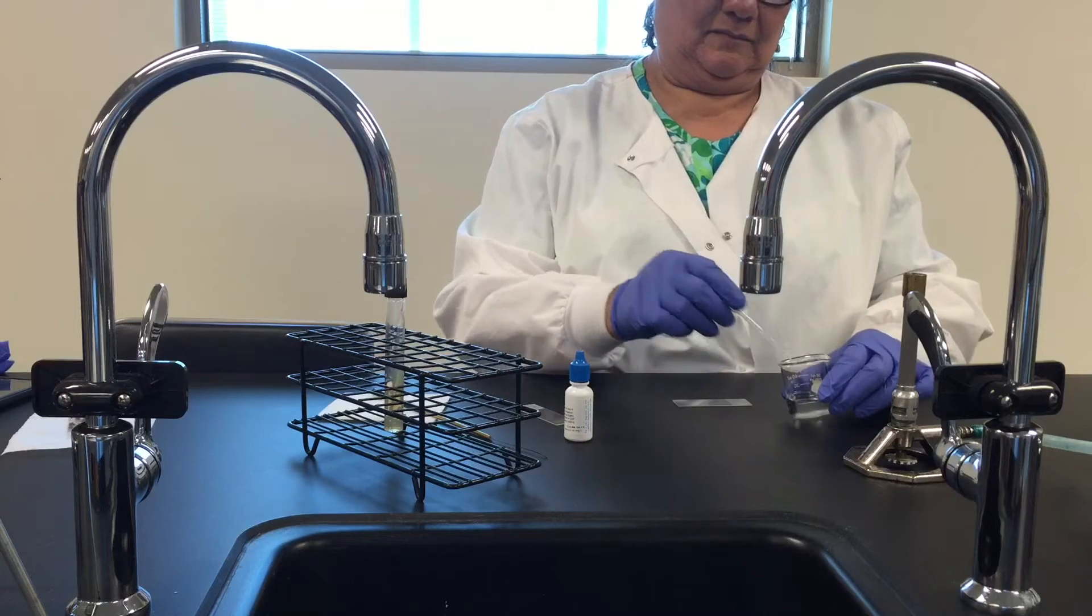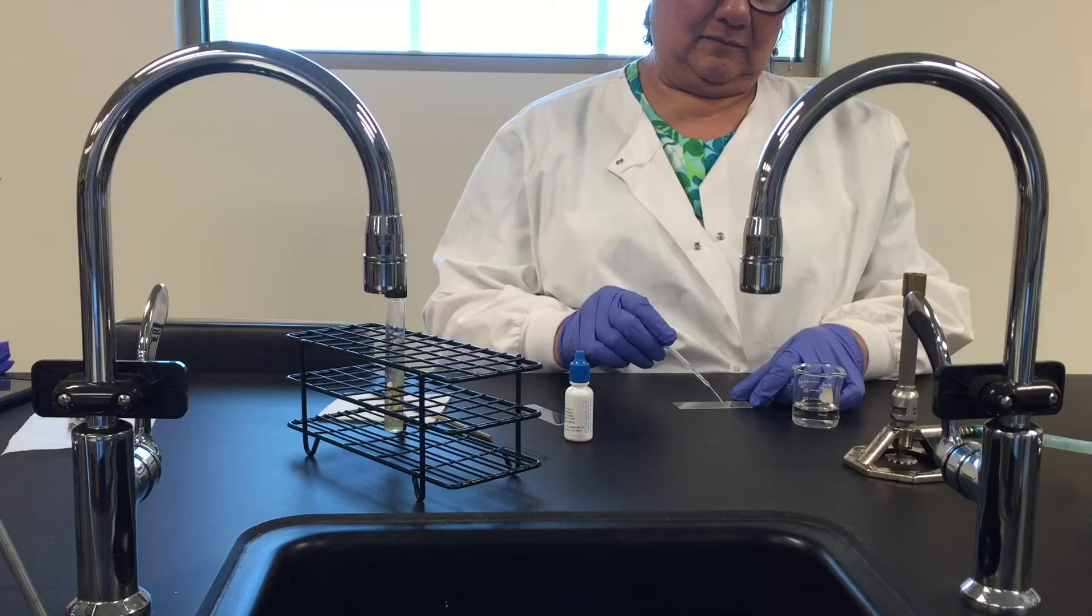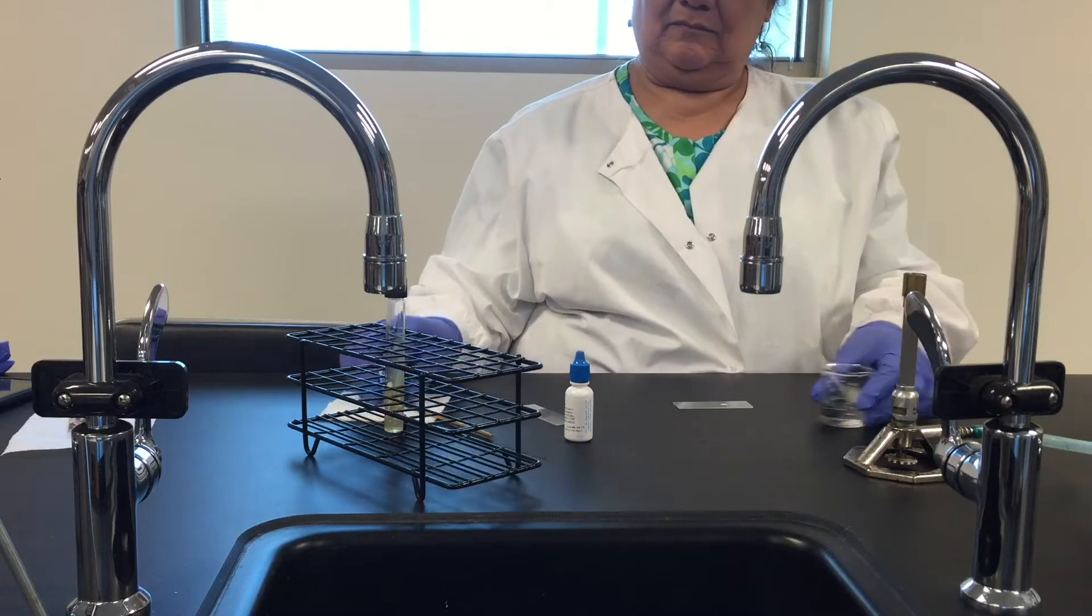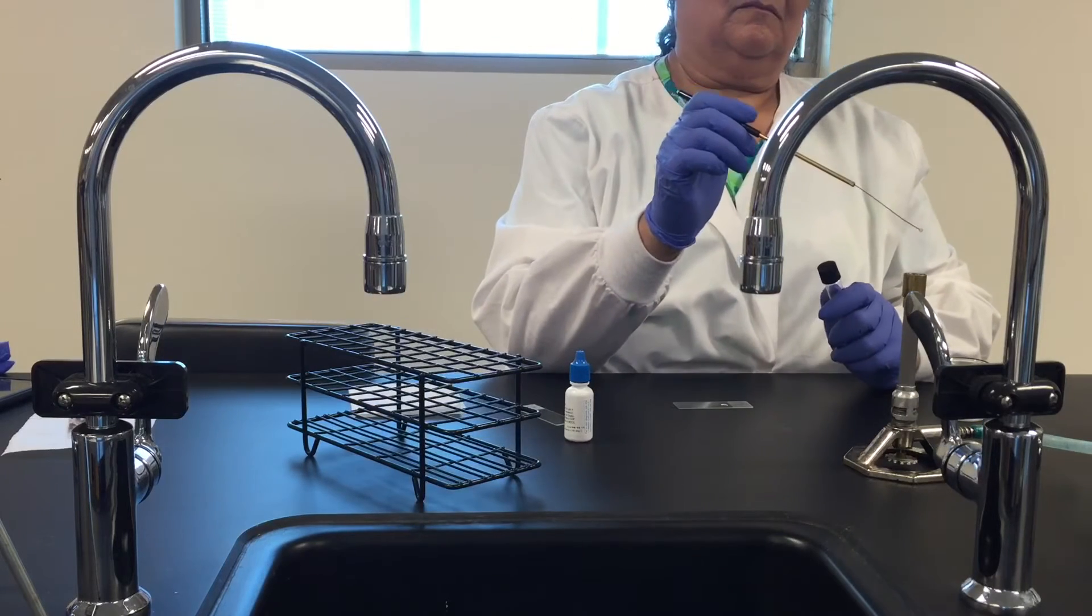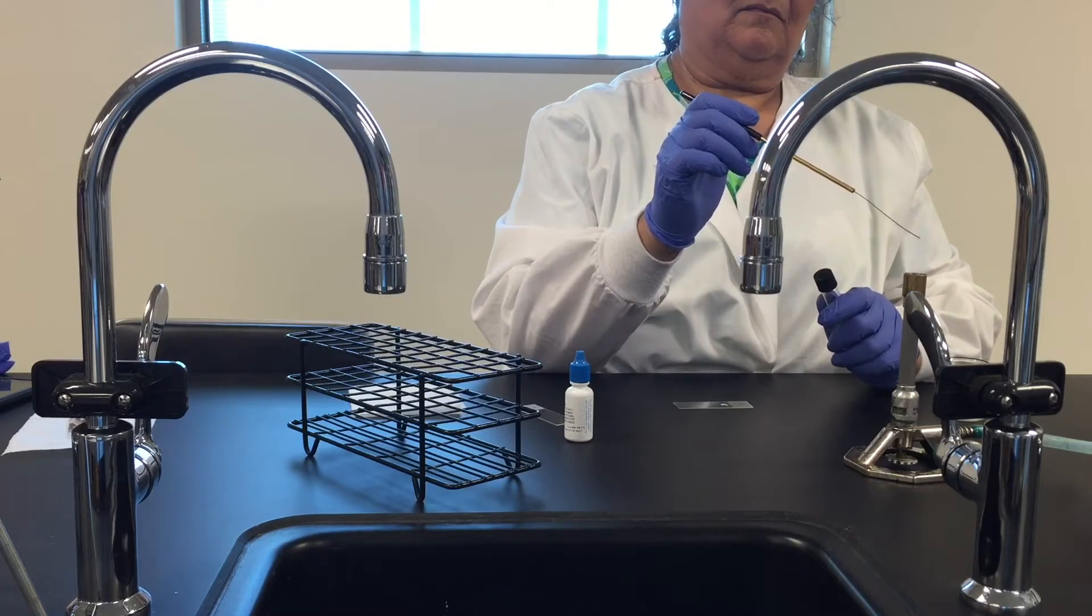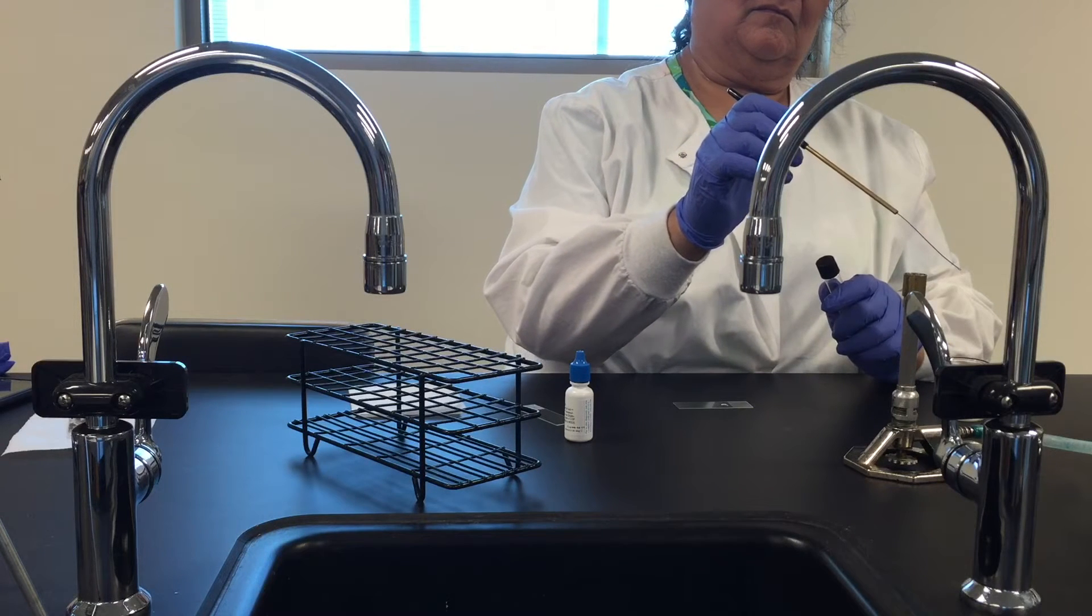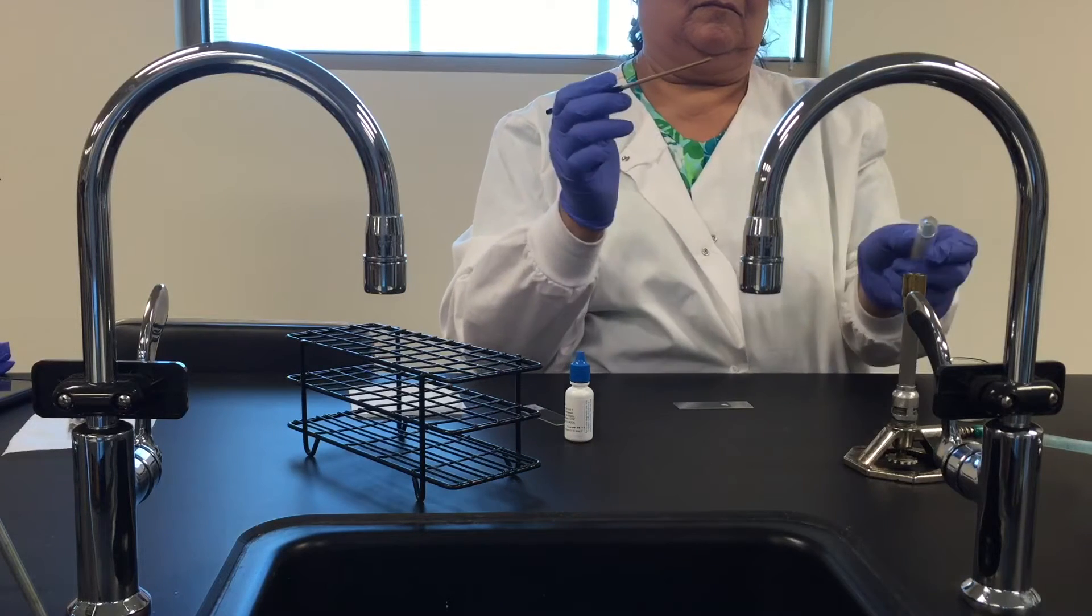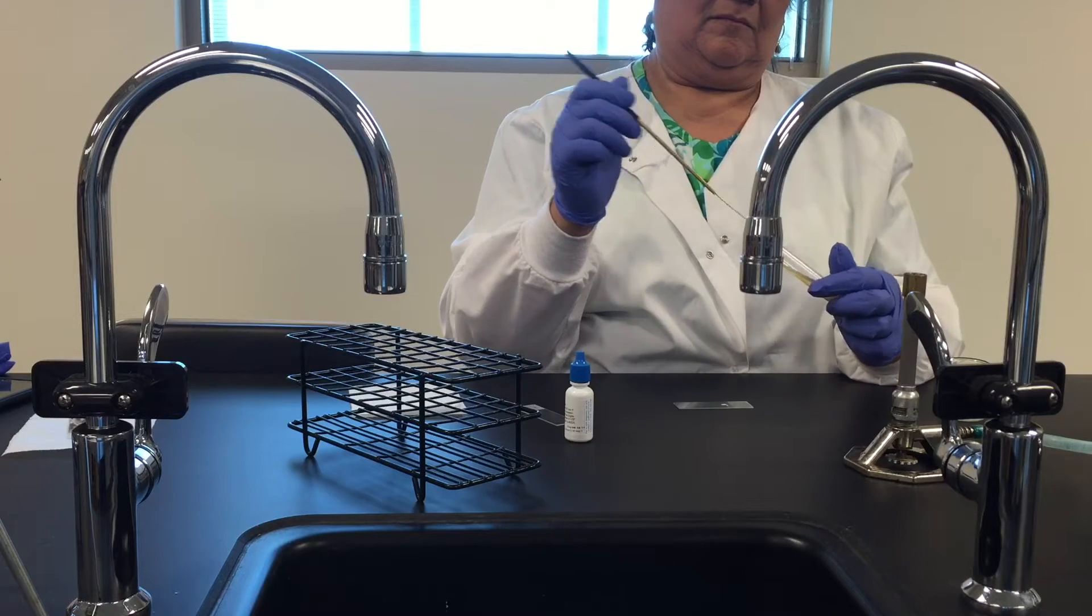We're going to start with a nicely scrubbed down microscope slide, use a pipette to put a couple of drops of water at one end of the slide, then we will aseptically remove a little bit of the organism from the slant that Renee prepared and that organism will get mixed into the drop of water. Now we're not going to spread it out at this point, we're just going to mix the organism into the drop of water.